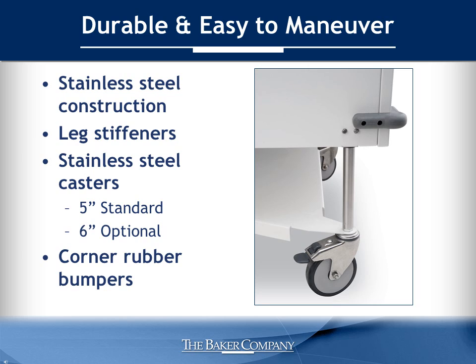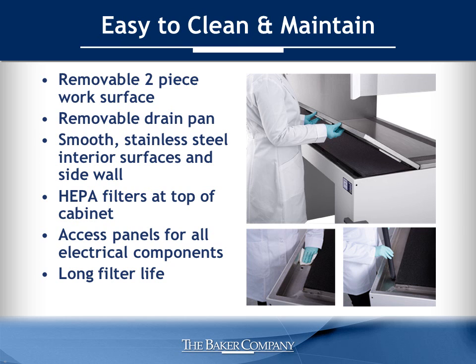With its stainless steel construction and leg stiffeners to provide a solid base, the AniGuard E3 was designed for durability. Large stainless steel casters with durable rubber treads make it easy to move the cabinet around a facility. Corner rubber bumpers protect the unit and the lab during minor collisions.